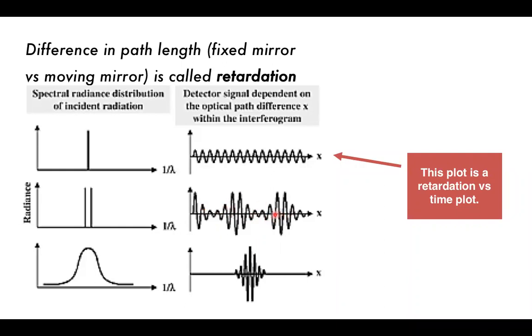Of course, depending on how we shift the mirror, we can change the number of wavelengths or fractions of a wavelength by which the split beam is different. And then after that, we can get this interferogram, which is the one that we will detect after the sample. This looks much like the one that we saw earlier, where we discussed how the spectral information was located here and here at the edges of our interferogram.